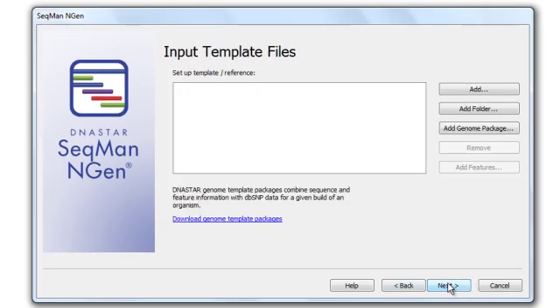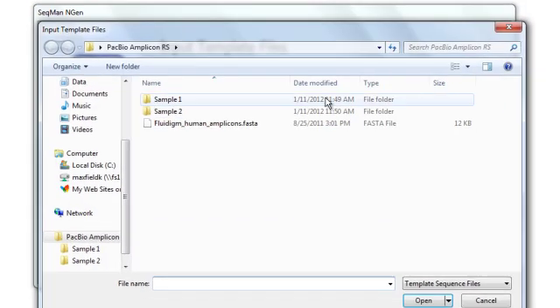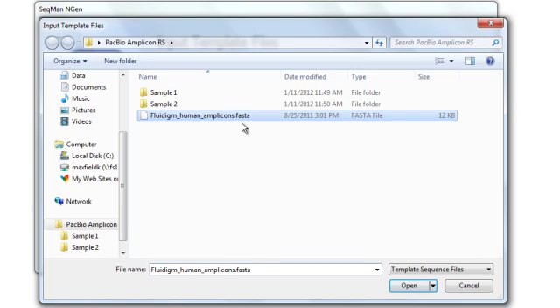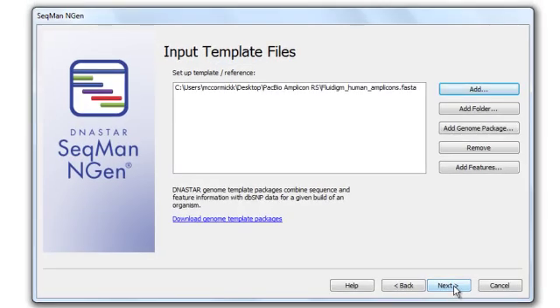Now I need to input my template files, and in this example, I'm going to be using a FASTA file that contains sequences for the exons in both the EGFR and MET genes. So I click Add, select my file, and then click Next.